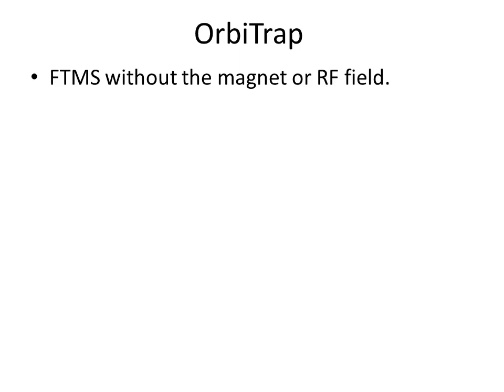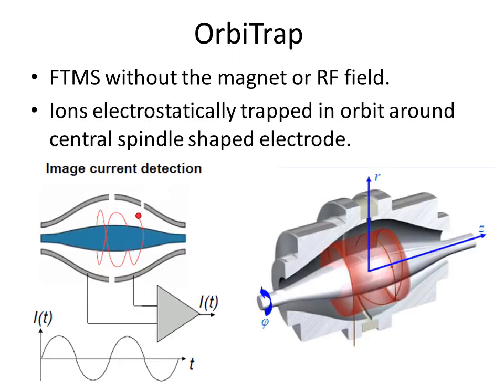There are not many uses of cyclotrons nowadays, because the problem with them is that they're very expensive to run, as the magnets require cooling with liquid helium. In proteomics applications, they have been replaced with an alternative type of cyclotron called an orbitrap, which does not have a magnet. In an orbitrap, the ions circle or orbit around a central spindle, again inducing current in collection plates, which is then interpreted by Fourier transform to produce a mass spectrum.